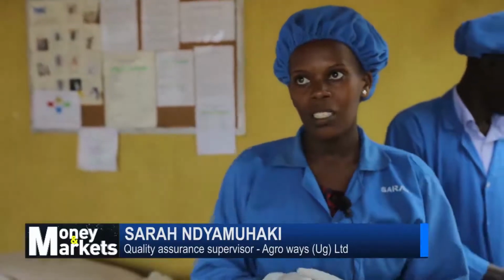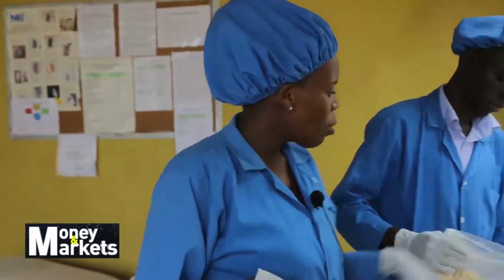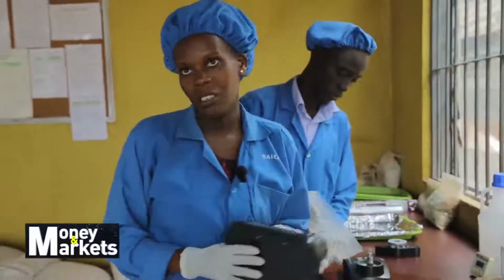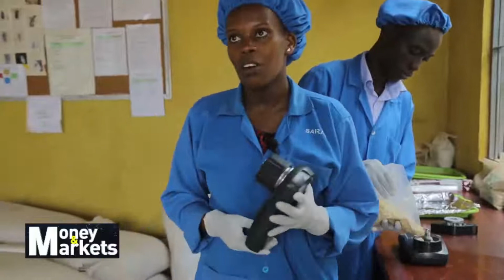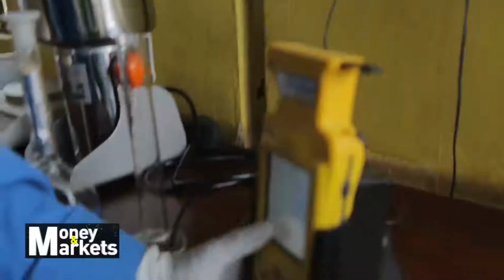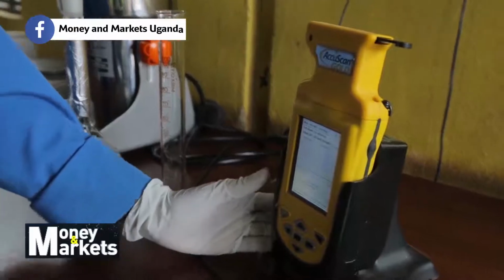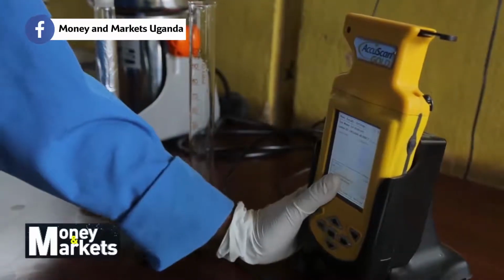When we receive grains at our gate, before we do anything, we have to do the preliminary analysis. We pick samples and bring them here to the lab. We have to take into account all the precautions and all the procedures. For example, we have to use the moisture meters when we are going to determine the moisture of the grains. After we have determined the moisture content, we also determine aflatoxin in this maize before we accept it into the company or before we take any action. As you know, the standard is 10 ppb.